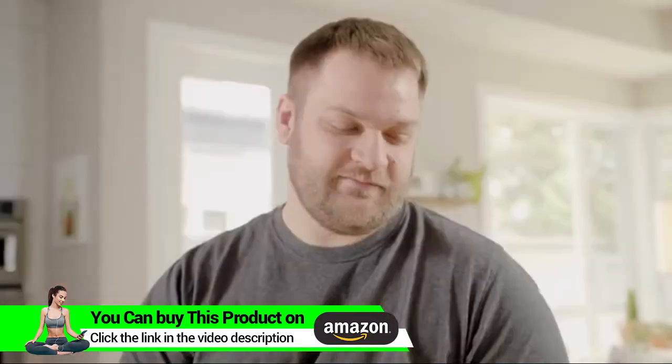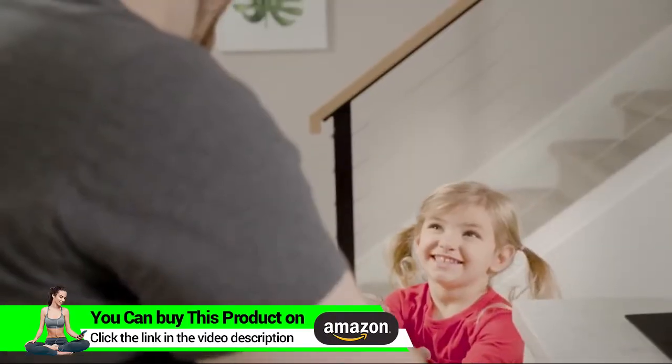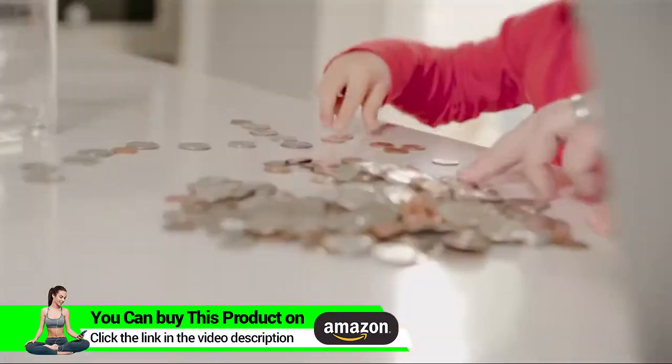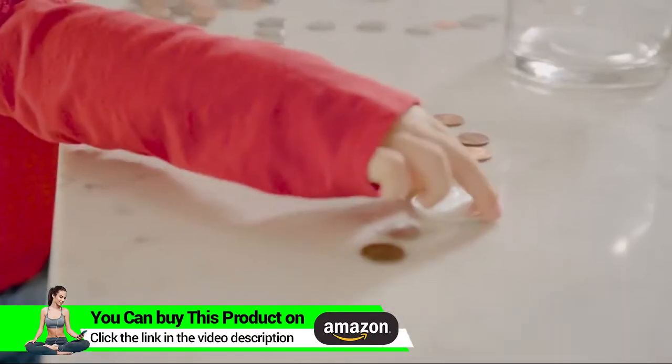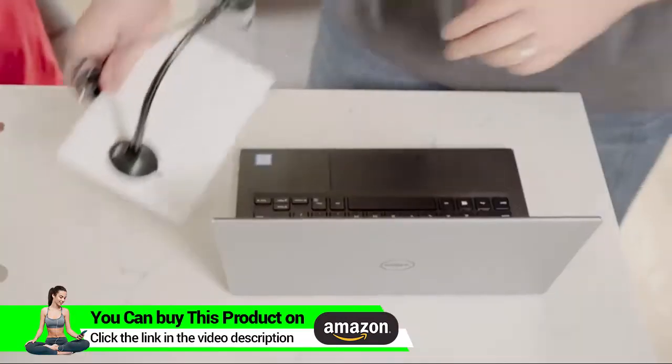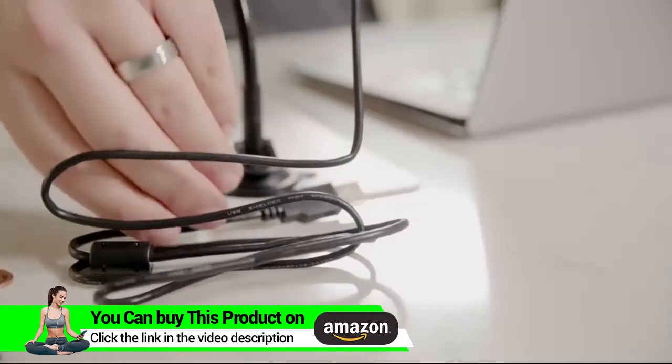Come along as we explore the microscopic world with the entire family. Whether you're in a lab, a classroom, or in the comfort of your own home, let your imagination soar, especially when you think you've found a national treasure, with Plugable's Digital USB Microscope.